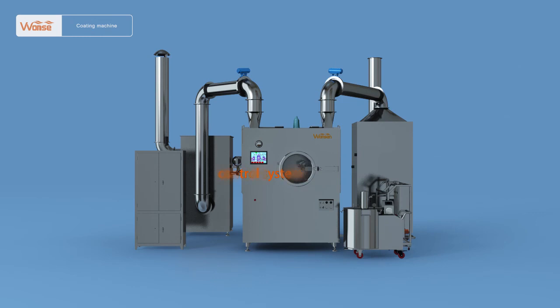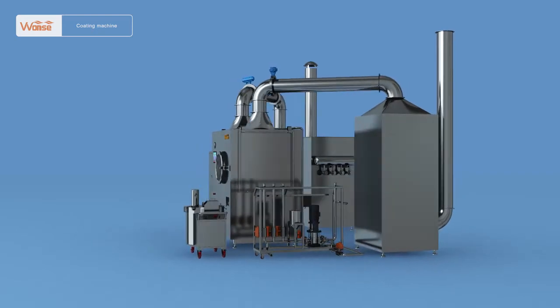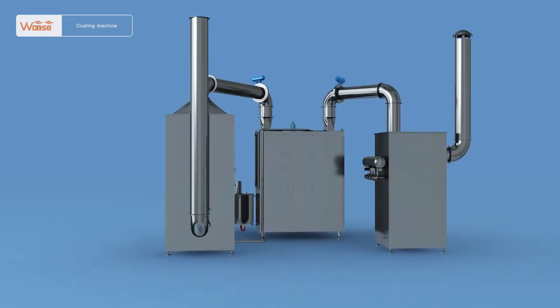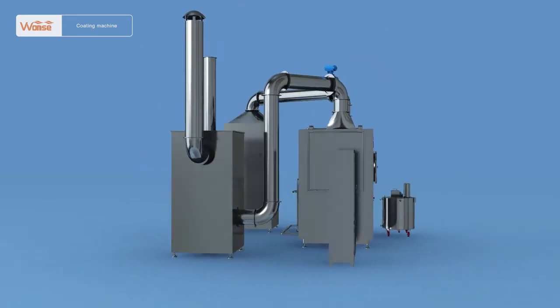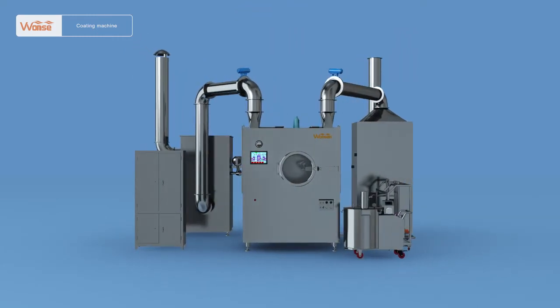The bodies of all main and auxiliary machines are elaborately made of stainless steel, fulfilling the whole process operation procedure. The sensors and actuators of top international brands and programmable controllers form an automatic control system and realize main machine dialogue.